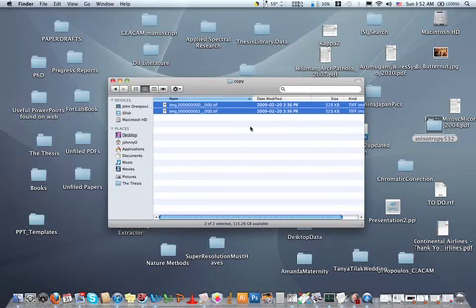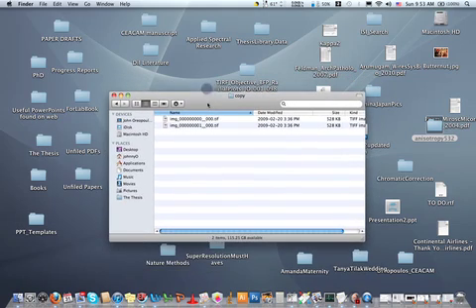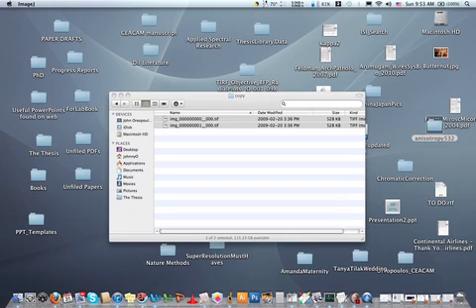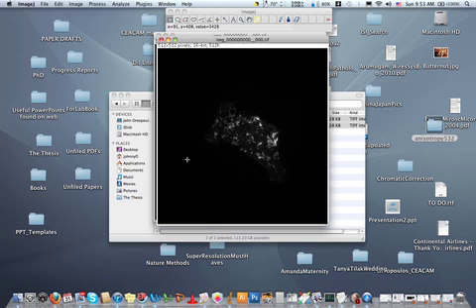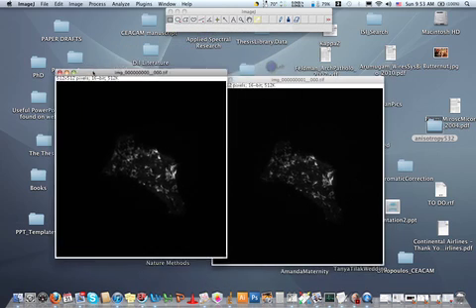Okay, so as promised, I'm going to show a little video here of how to create a normalized scattergram using homo-FRET imaging data. I just have a typical example here. This is the one that was actually used in the paper. I'm going to open up these two images in ImageJ just so you can see how this looks. Okay, so this is number 000.